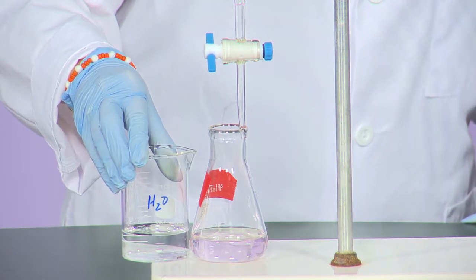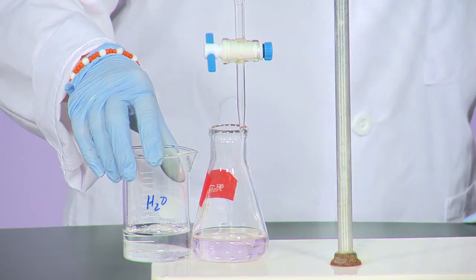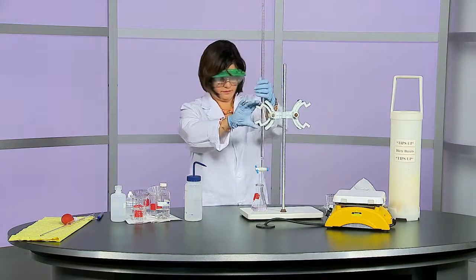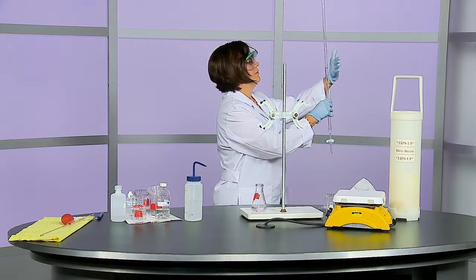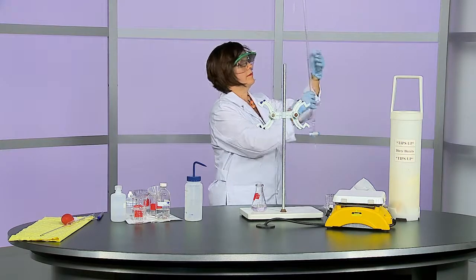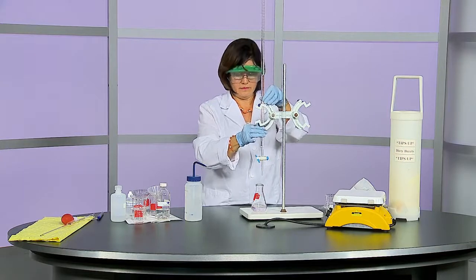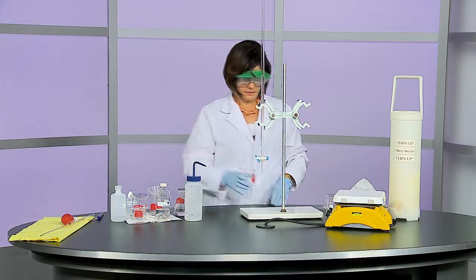A beaker with water placed next to the Erlenmeyer can help as a comparison to detect the pale pink. Read and record the final volume on the burette to 2 decimal places. Remember to read it at eye level. Typically, you will want to perform several trials of the same sample in order to obtain good accuracy through averaging. Make sure that all your trials have a pale pink endpoint.